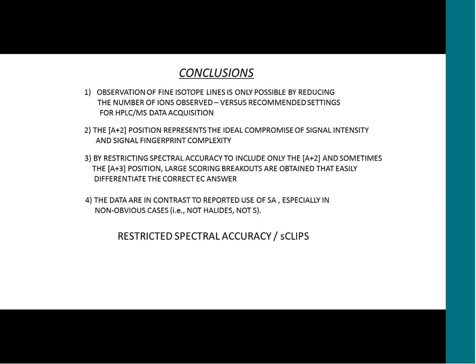Last, the data are in contrast to the reported use of spectral accuracy in the literature, where generally full profiles are considered, and especially in the non-obvious cases that don't involve halides and nothing obvious like lots of sulfur. These reports generally show you lists of competing answers, and they don't get you to the exact answer.